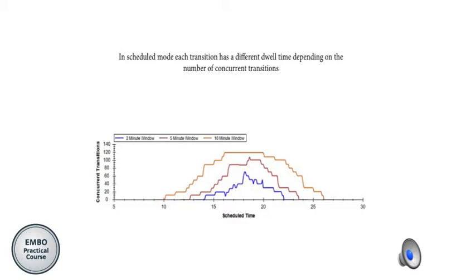Skyline has a tool where you can see how many transitions are co-eluting at any particular time, which is very useful. Because we set a window of time rather than a single point, depending on the size of this window we can have more or fewer concurrent transitions. For example, with a two-minute window the maximum concurrent transitions is 60, which allows a decent cycle time. If the window is wider, there will be more concurrent transitions at a given time. This is something to check when preparing your method in scheduled mode — if the window is too wide and you have too many concurrent transitions in one region, you may need to split the experiment into two methods or reduce the window size.